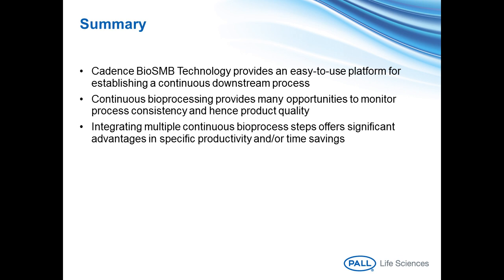Do you have a more complete answer to that question, Mark? Well, what we normally do is that we have different phases or different methods run consecutively. So if you look at one batch, if I use the BioSMB system to purify all the material that comes from one bioreactor, I first equilibrate all the columns, which becomes one data file, and then I process all the material from that batch, which becomes one data file. And after that, there's going to be another method to elute the remaining product from the system after all the material has been loaded on the system. At the end, I want to elute even the last little bit of material from the column. That becomes a different method and therefore a different result file.